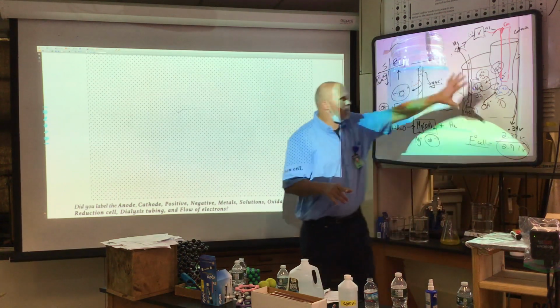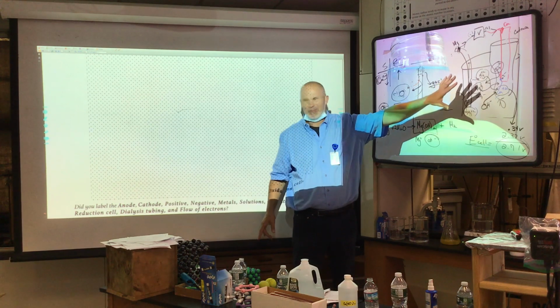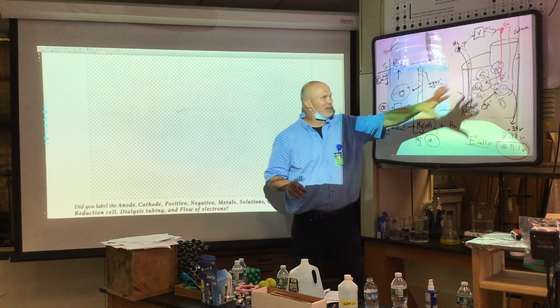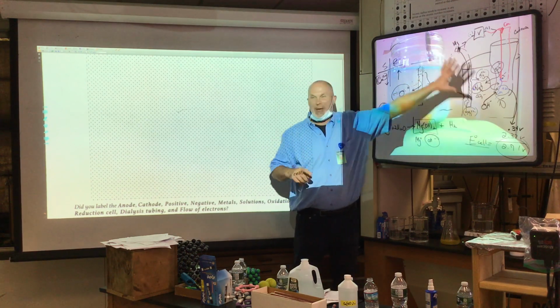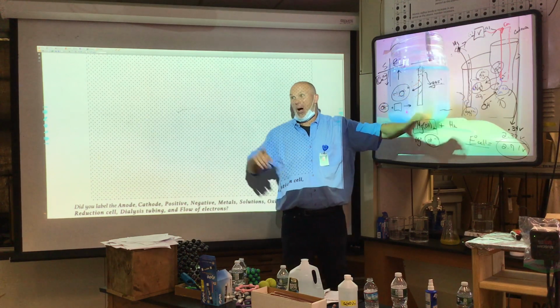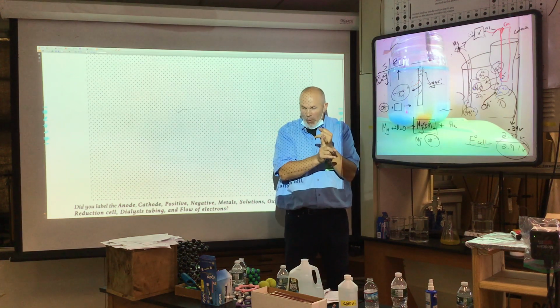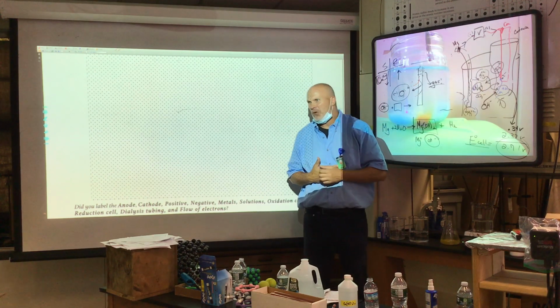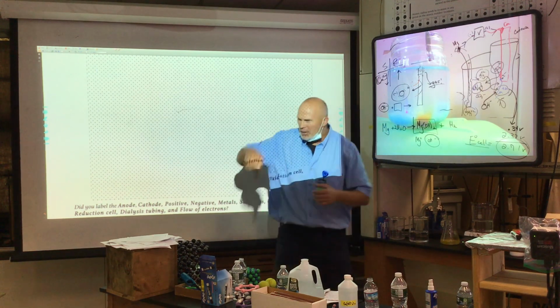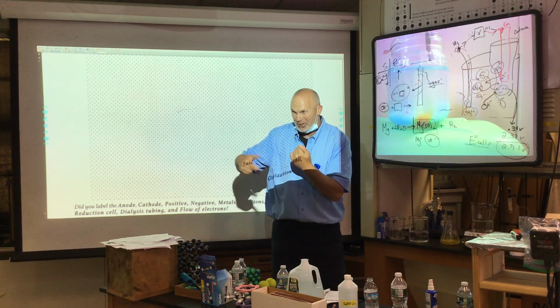In order for this to equal, let's pretend no issues that we just talked about here: reacting with the water, making it precipitate, the copper leaving. How about another issue? Let's say that all that didn't occur. Standard. Are we at standard conditions? Were we at 25 degrees Celsius? No. And were these 1 molar? I know I didn't make them. Now, how did you know they weren't 1 molar? Were we under what we're supposed to have? So you can probably guess that I didn't have 1 molar solutions.